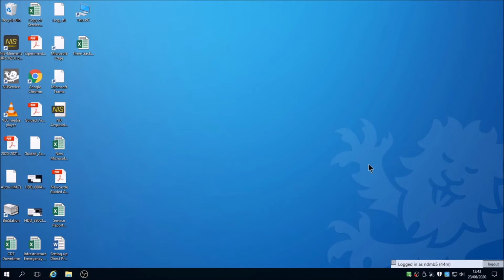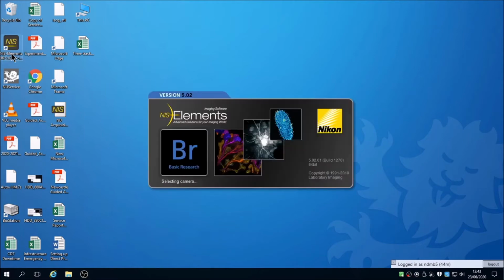Start up the computer and log in using the command desktop. Once logged in, the PPMS tracking software will start and ask you to confirm your project and account details. Once at the desktop, ensure all components of the microscope are switched on before starting the NIS Elements software and allow it to load. The TE2000 is completely manual, however making changes to the microscope setup in Elements will be reflected in the metadata of your images, so correct scaling and wavelength is applied.